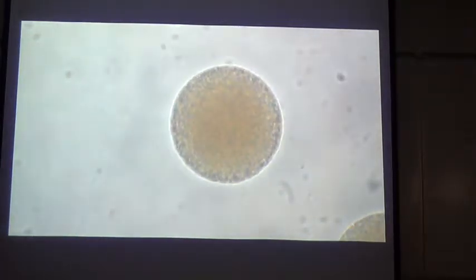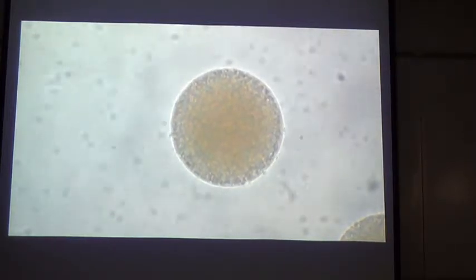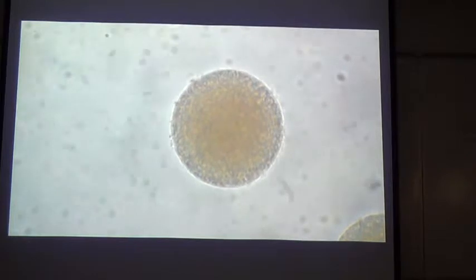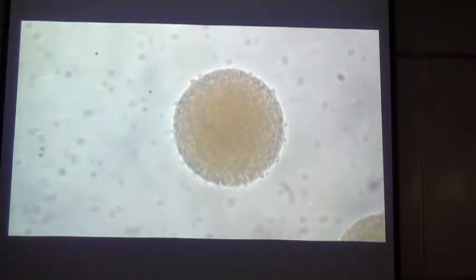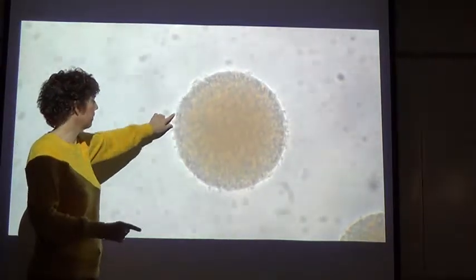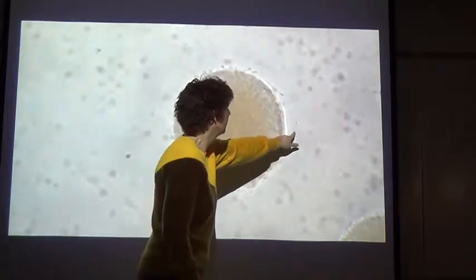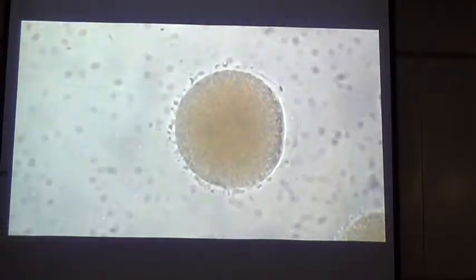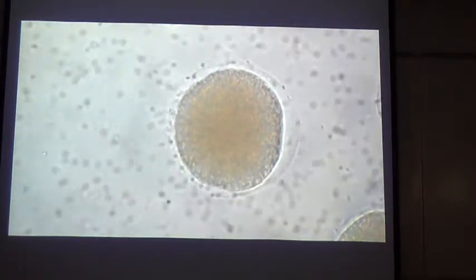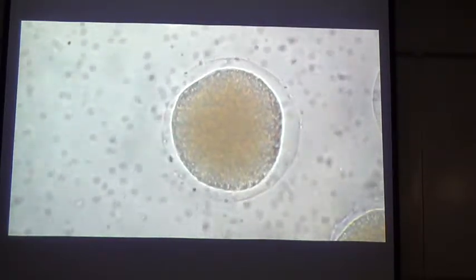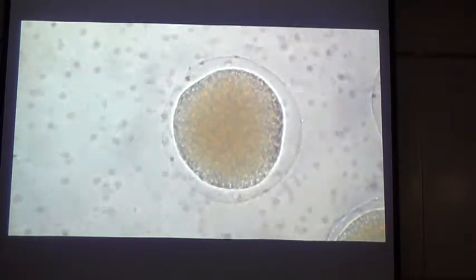The sperm's been added to all the water is moving just because of the addition of the drop. Oh wow, it's really good. These are very happy sperm. Is that all the sperm total? Yeah, all those little black dots that are out of focus, that's why they look so big. So these are all the sperm. So their acrosomal reaction is breaking through that fertilization membrane. Here somebody's gotten through. See that how it's moving that out. That is that cortical reaction. It's pushing the rest of the sperm away. Yeah, it's pushing them away, knocking them out if they started to penetrate through. And then that fertilization membrane will harden. So that's what we would see if our sperm were happy.